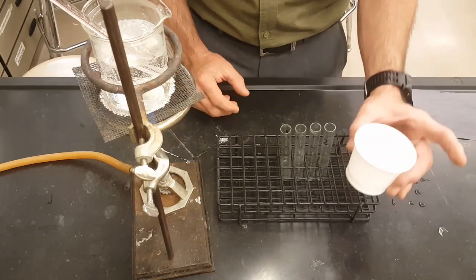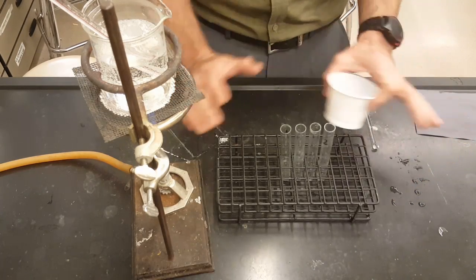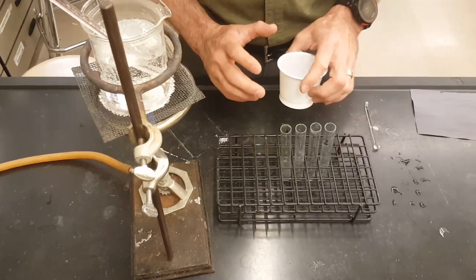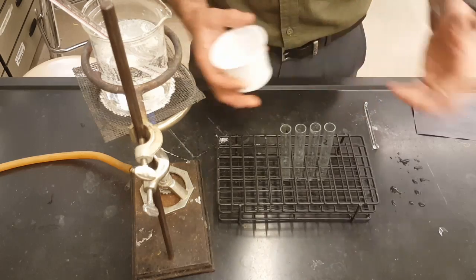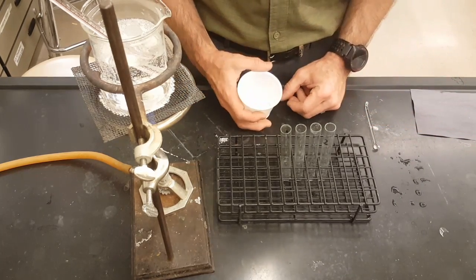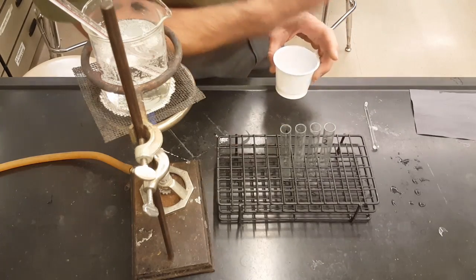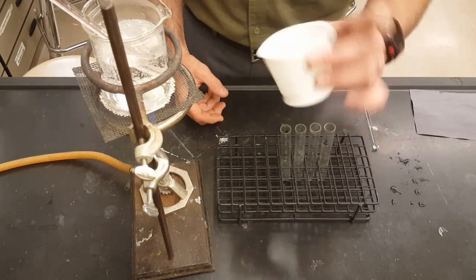Then go to the center bench in the lab to get the deionized water. Don't use any tap water today. When the tap water boils, it leaves behind a lime scale, and it makes things cloudy and dirty, and we have to clean it. There are 2 dispensers in the middle of the lab that have deionized water. So go get some in this.